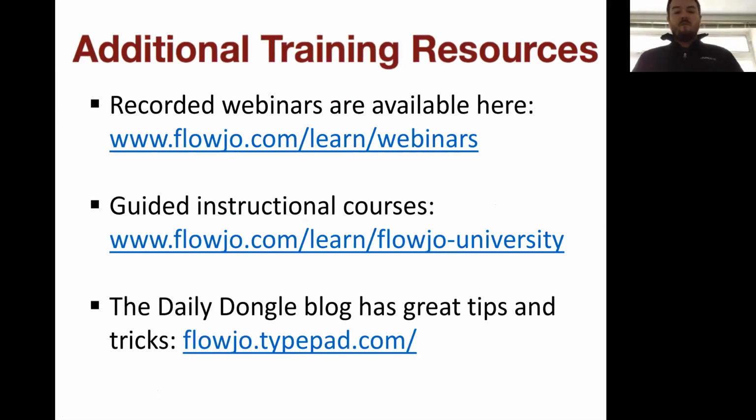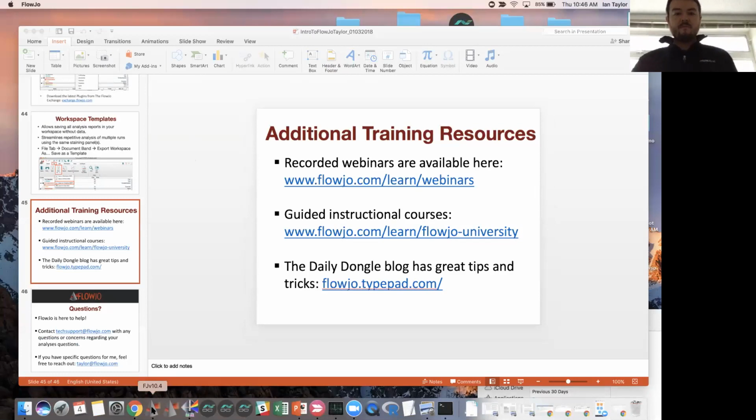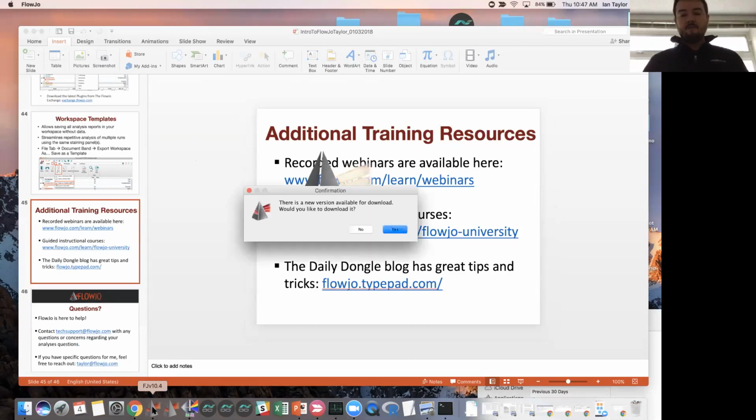So one of our viewers is asking, can you touch on overlays? And yes, I absolutely can. I might even go so far as to open up the software, make sure you guys can see my screen. I'm going to share my desktop with you guys so I can start up the software. And I'll actually go through an overlay just to show you how an overlay is created and maybe some of the options that are available for overlays.